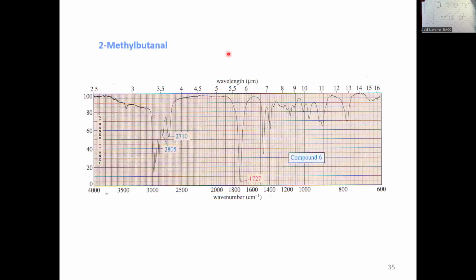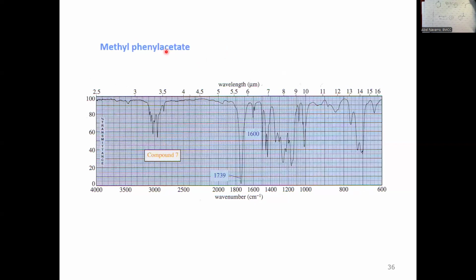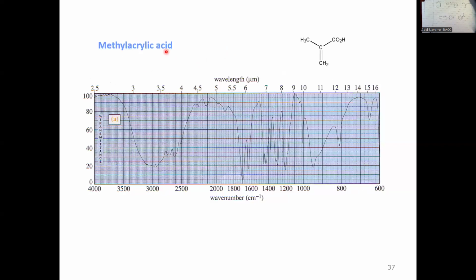All right, so here we have many more. My recommendation is that you just Google this to see the structure, and try to identify in every peak, with what you see, the functional group of the compound. Okay, this one is good because it tells you this is a carboxylic acid. See, that's why the peak is very distorted.